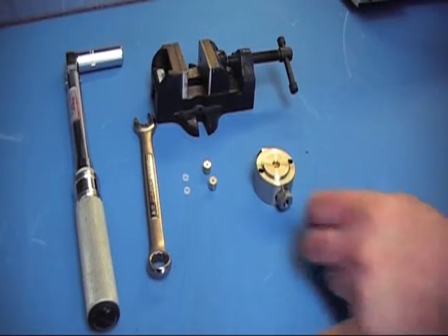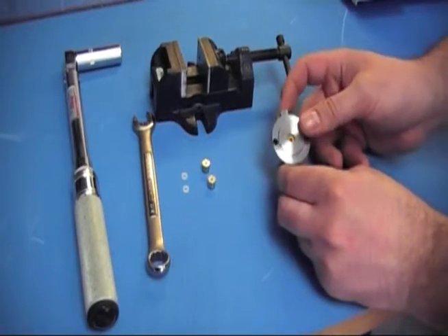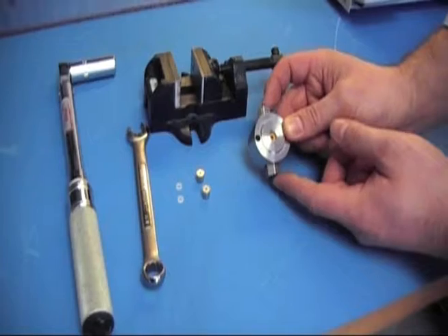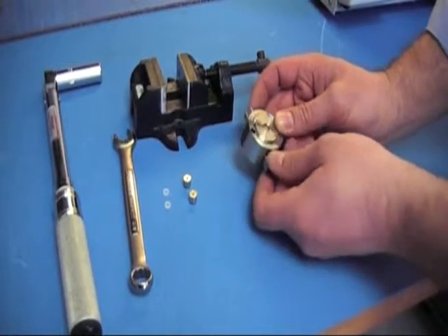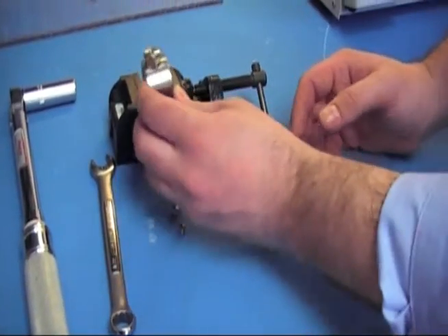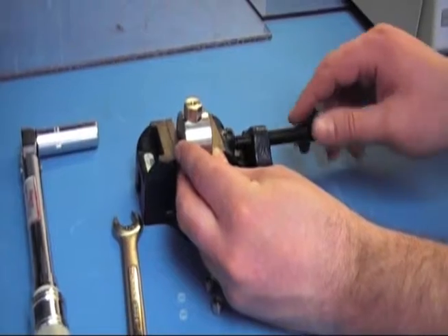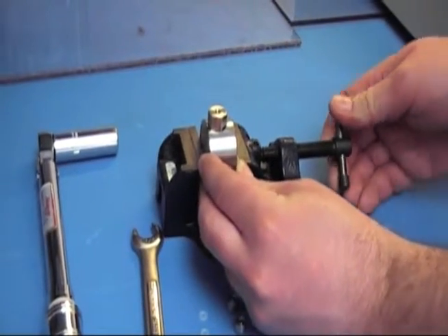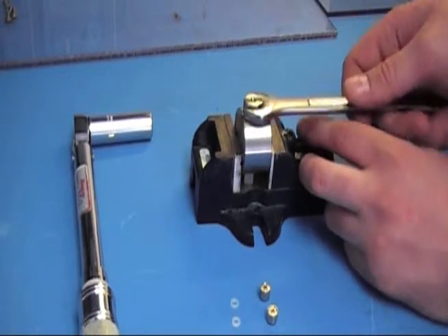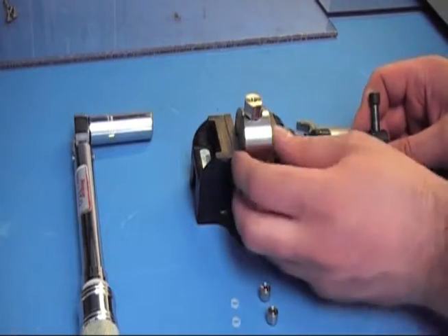After you have the head removed, you want to loosen up the check valve housings so you can get the check valves out. For this, I recommend a vise. Slide it in — it doesn't matter which end you start with. Get your half inch wrench, and you don't take it all the way off yet, you can just loosen it.